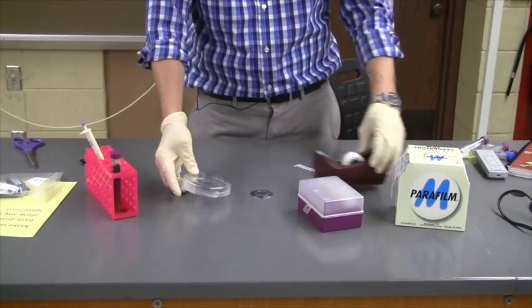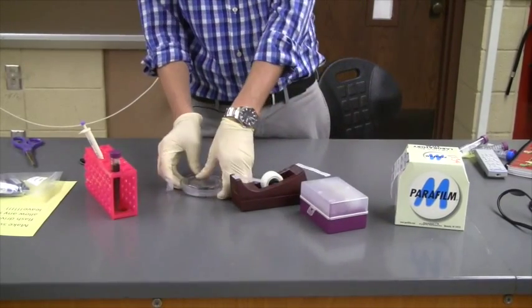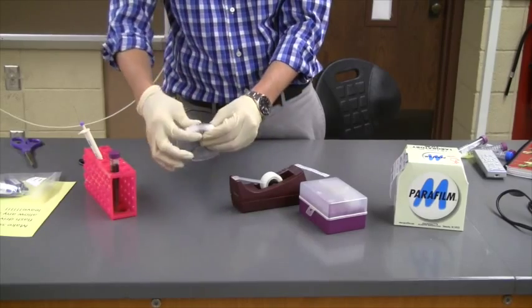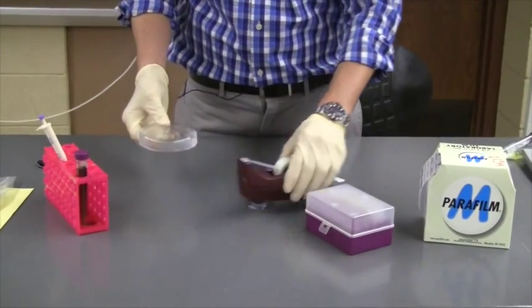If we don't have parafilm for some reason, you can always just take a couple pieces of scotch tape and stick them on the side like that. Do that a couple more times and seal it up that way.